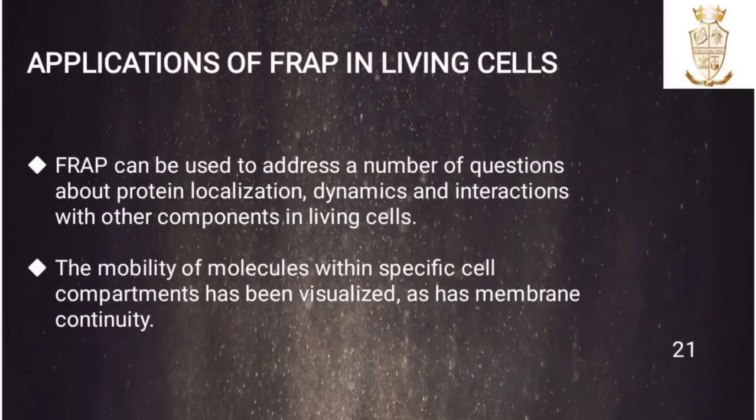Then applications of FRAP in living cells. FRAP can be used to address a number of questions about protein localization, dynamics, and interactions with other components in living cells. The mobility of molecules within specific cell compartments has been visualized, as well as membrane continuity.